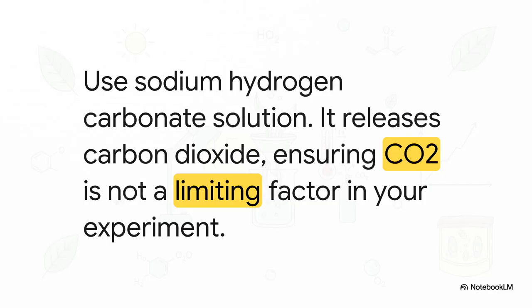It might seem a bit random, but it's actually super important. And here's why. This is a huge exam tip, so listen up. You add the sodium hydrogen carbonate to the water because it provides a steady, constant supply of carbon dioxide for the pondweed. See, we want to investigate how light affects the rate, so we have to make sure that a lack of CO2 doesn't become the limiting factor instead and completely mess up our result.